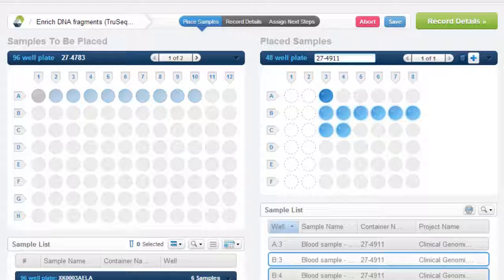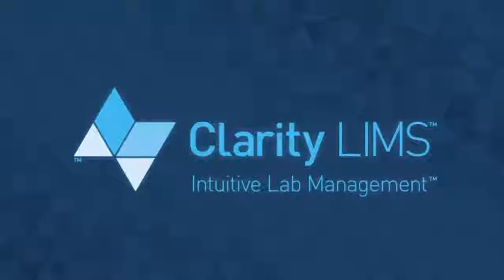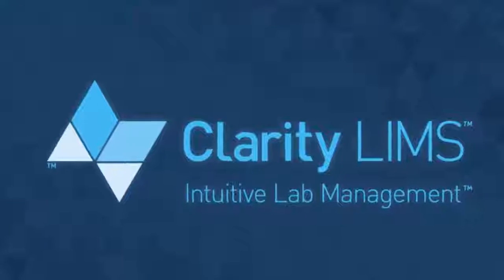This is how you can quickly add a new container type and configure steps to be associated with it in Clarity LIMS.